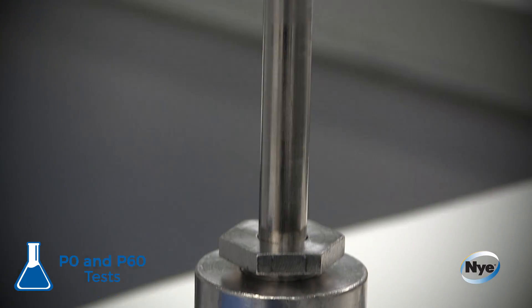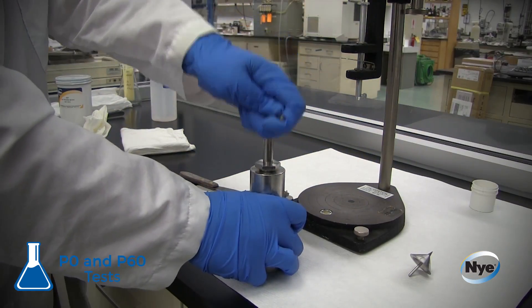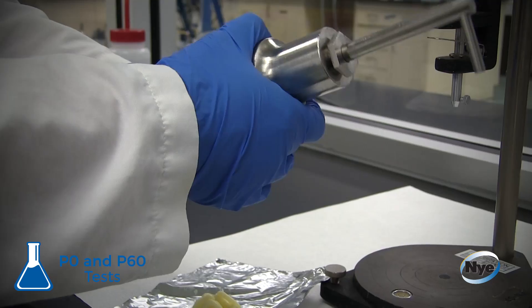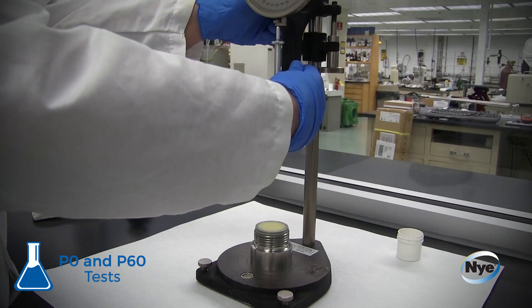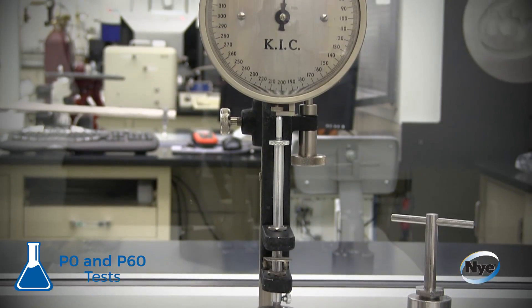The grease is then sheared using a mechanical worker through 60 double strokes, simulating the use of the grease. When this is completed, the technician repeats the cone test to determine the P60 value, also known as a worked penetration.